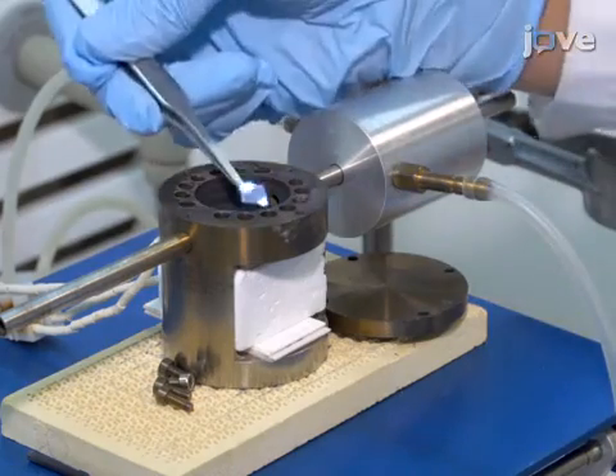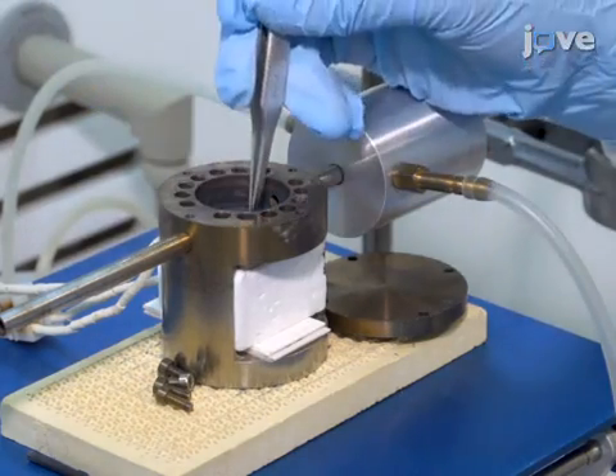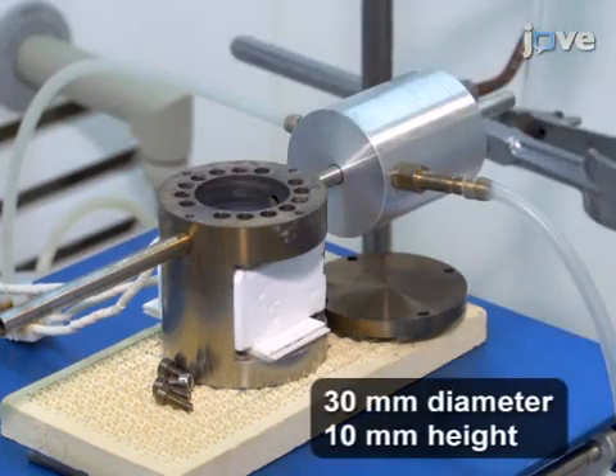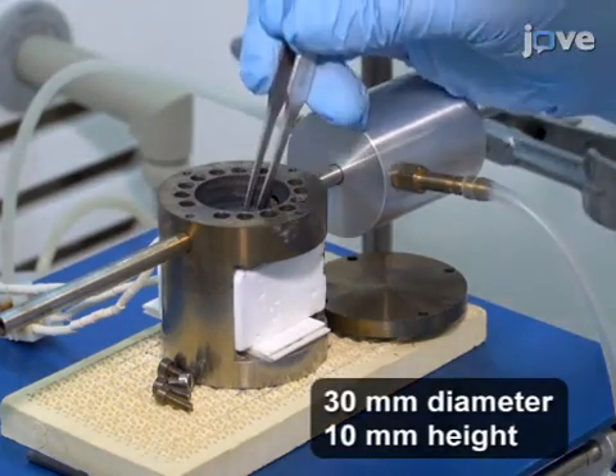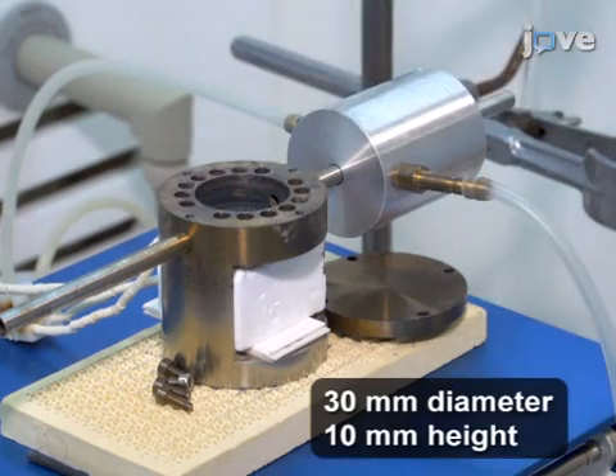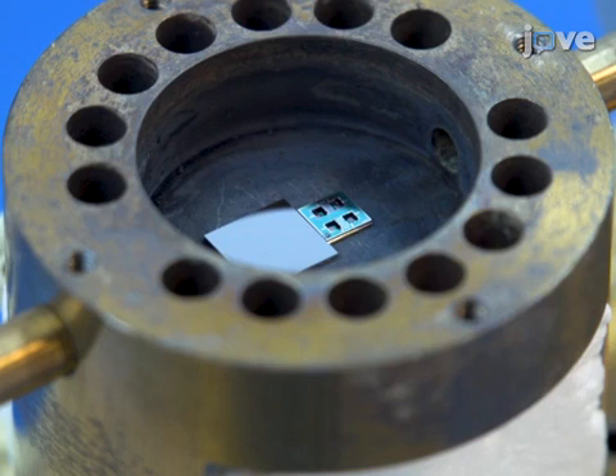Place the substrate into a homemade stainless-seal cylindrical reaction cell with an internal volume of approximately 7,000 mm cubed, adapted to the dimensions of silicon-based micromachined platforms employed for the fabrication of gas sensors. Place the silicon-based micromachined platforms into the reaction cell and align with a shadow mask to confine the growth of material to the area of interest.